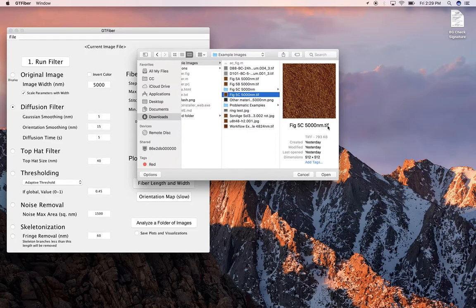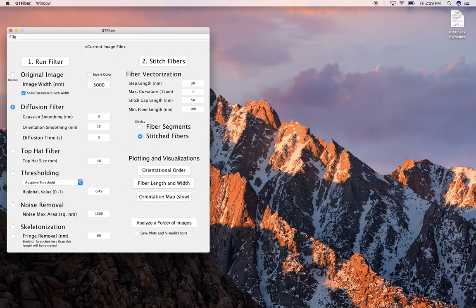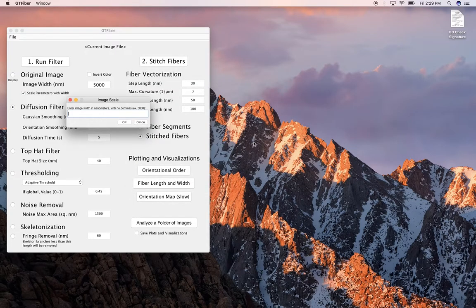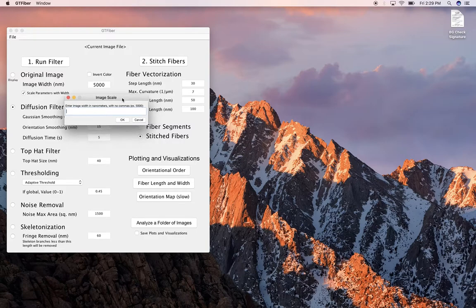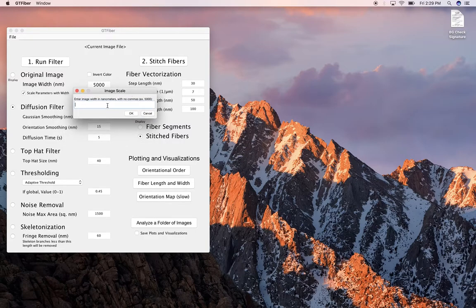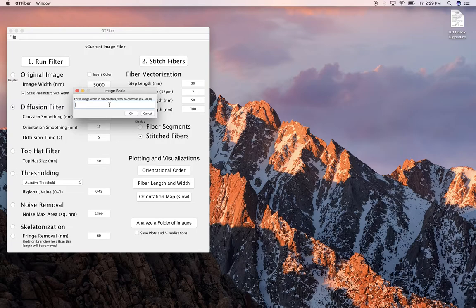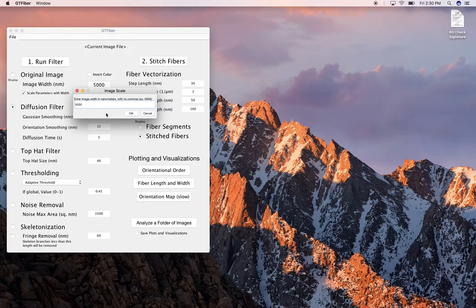It can be a jpeg, it can be a tiff, png, bitmap, I think those are the supported file formats. So we're going to open that up. All right, the first thing it comes up with is image scale, and so it's asking you to enter the width of the image in nanometers with no commas, so just a number. This particular image was a 5 by 5 micron image, so we're gonna put in 5,000 for 5,000 nanometers.